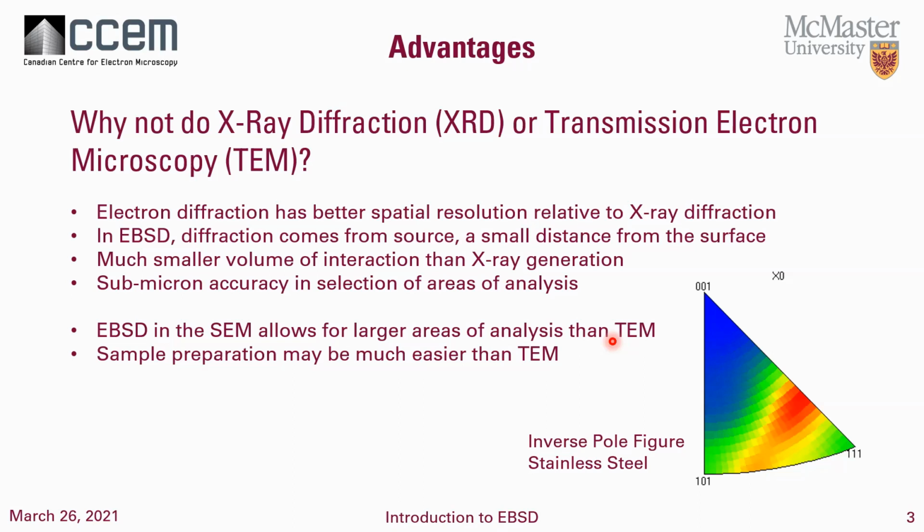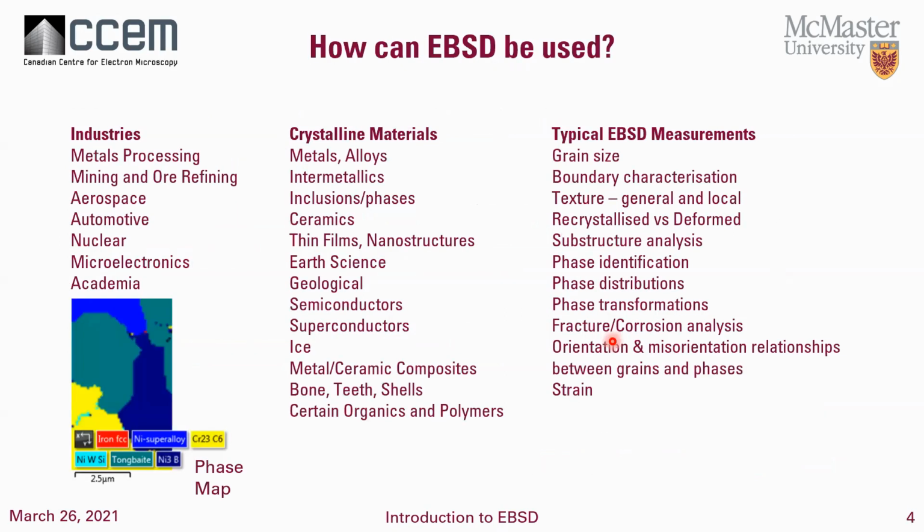You can collect fairly large areas, so this is quite often done in geology. And quite often the sample preparation is much easier than TEM, but that's not always the case. So it can be used in a lot of different circumstances.